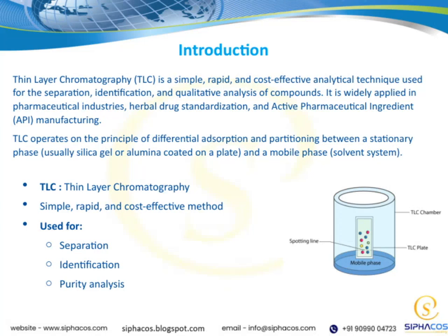Today, I want to introduce you to thin layer chromatography, or TLC for short. It's a technique that's known for being simple, quick, and cost-effective, making it very accessible for many laboratories. TLC is primarily used for three key purposes: separation of compounds, identification of those compounds, and checking their purity. These functions are crucial in various fields, especially in pharmaceutical industries where precision and reliability are vital.